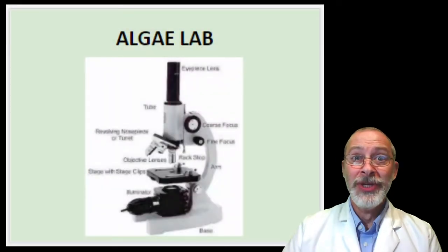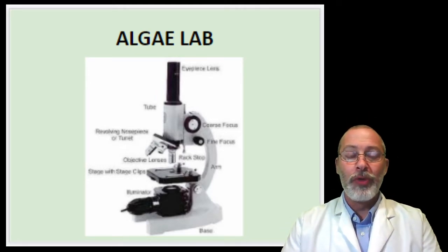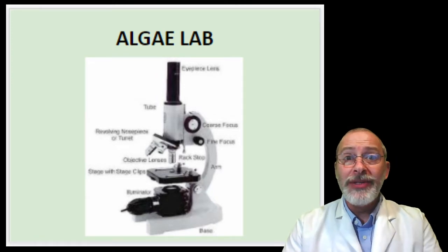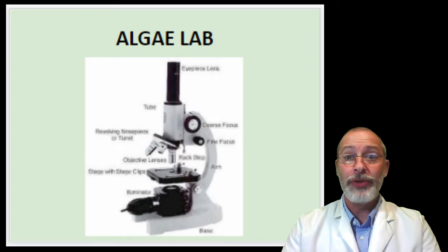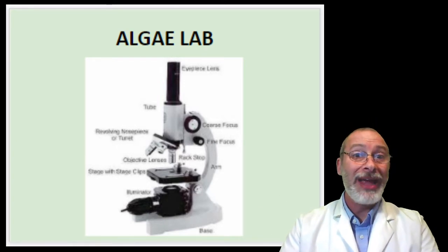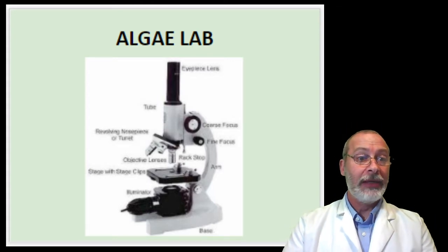Welcome back. So here for our virtual lab, we are going to be performing the algae lab using images taken under magnification. Not a bad idea for you to be reviewing the parts of a microscope and how microscopes are used before we actually use them in the laboratory.